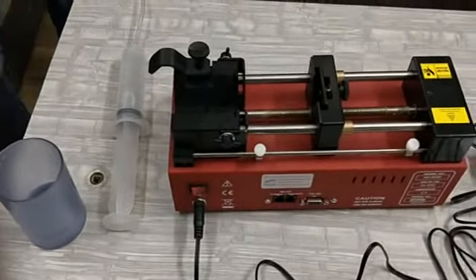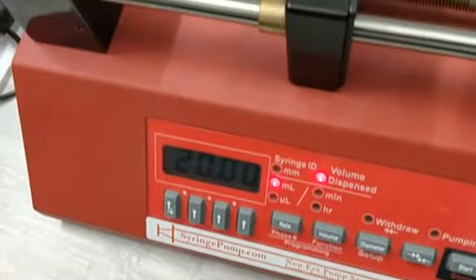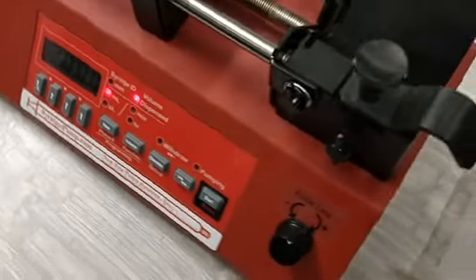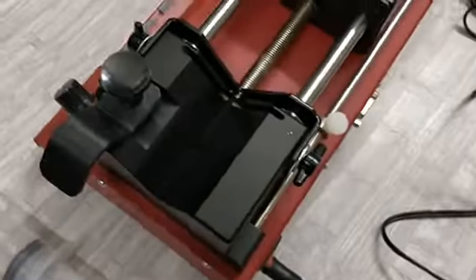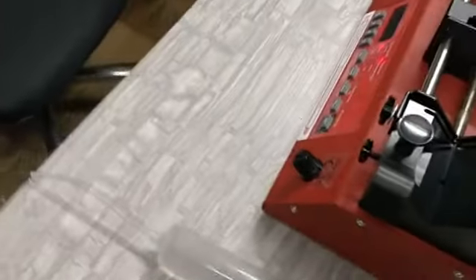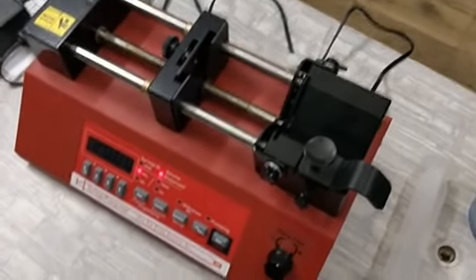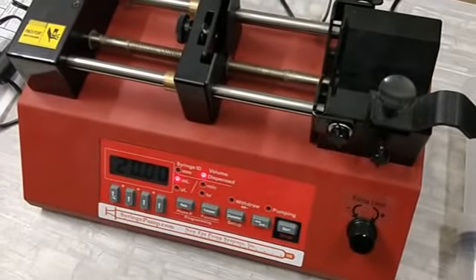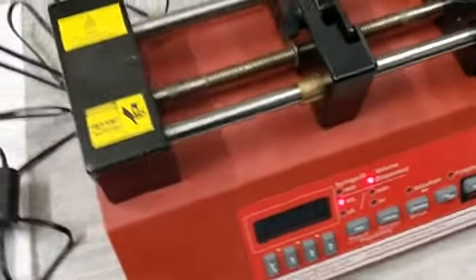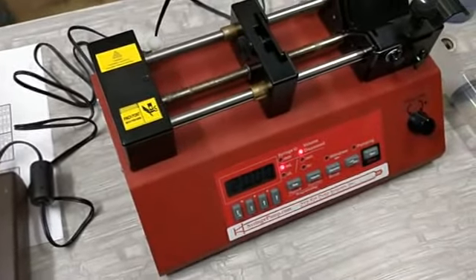Dear customer, we thank you for purchasing the New Era Syringe Pump. This particular model is NE-8000. Before this, we have sold a lot of syringe pumps, normally called the NE-1000 series. There are two or three basic differences between the NE-1000 series and the NE-8000 pump.